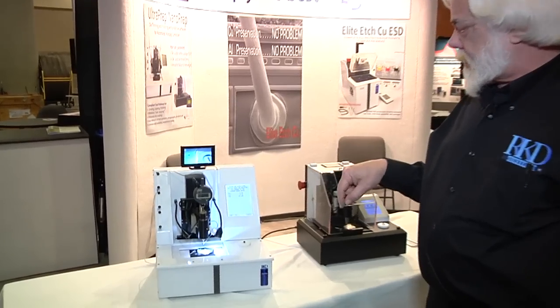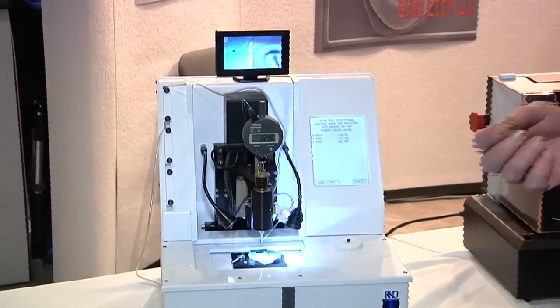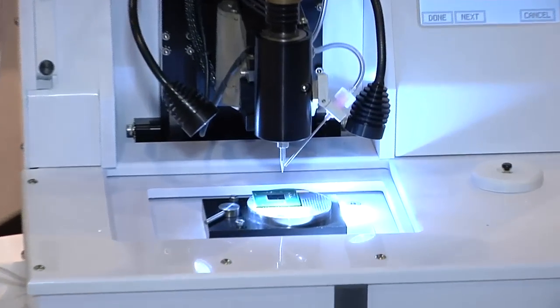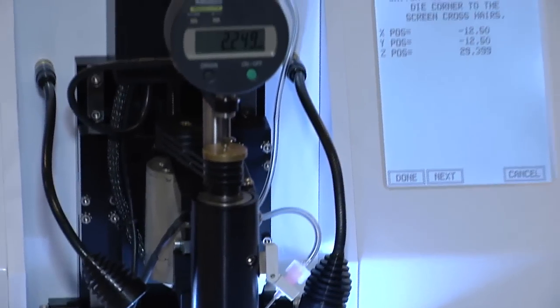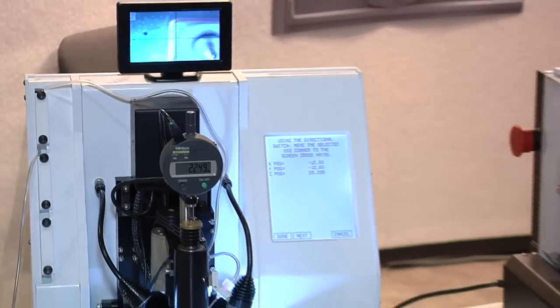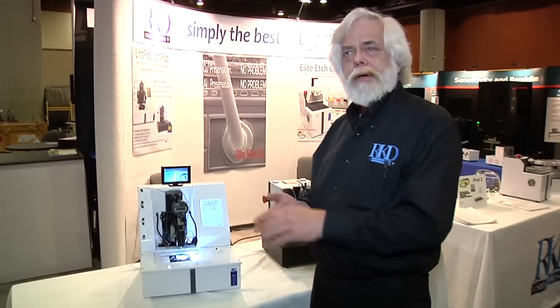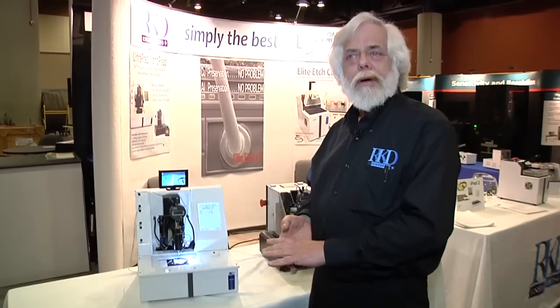Each spot is measured a minimum of twice. If the two numbers don't agree within one micron, it will continue taking measurements until they are within one micron. This eliminates any distortion introduced by environmental vibration or any soft debris on the die surface.